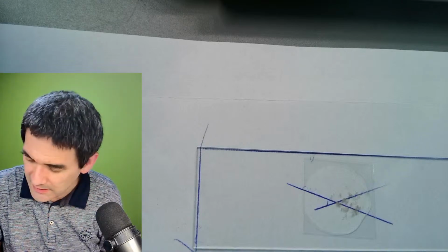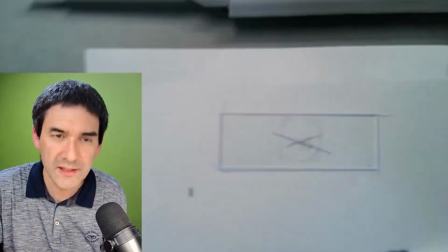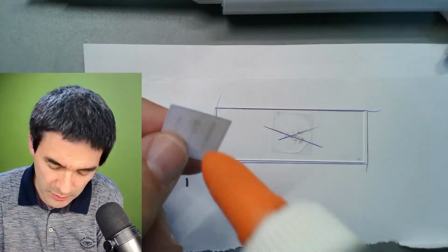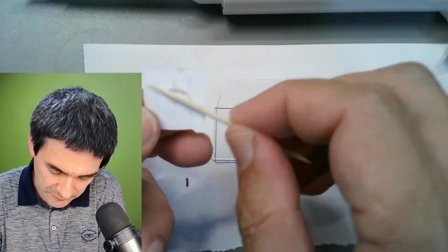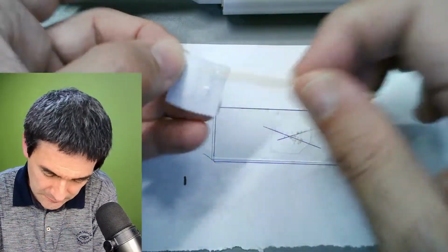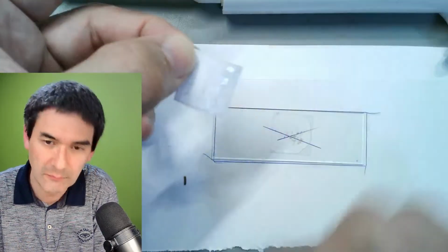And I decided that when we already make slides, we make them properly. I would like to add a little bit of glue here as well, and spread it up. Okay.